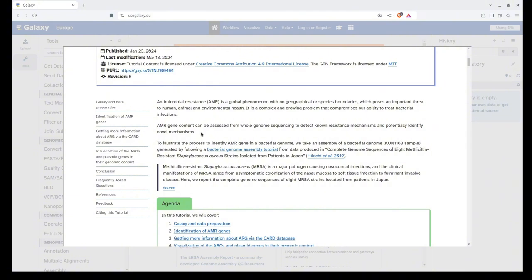To understand the process of AMR identification, in this tutorial we will use the bacterial genome assembly of the KUN1163 sample, which was generated by a bacterial genome assembly tutorial using data from a study by Hikichi et al. in 2019. So let's get started.